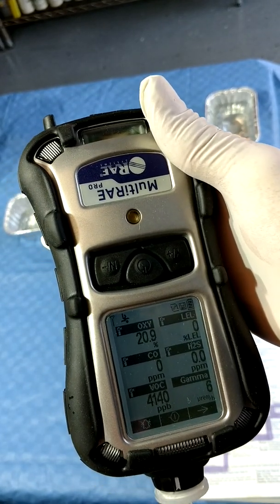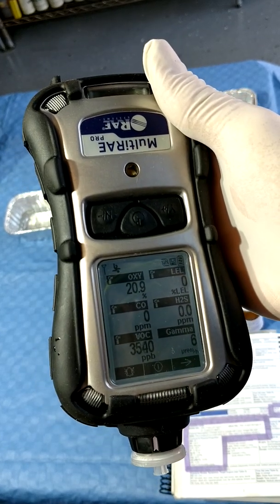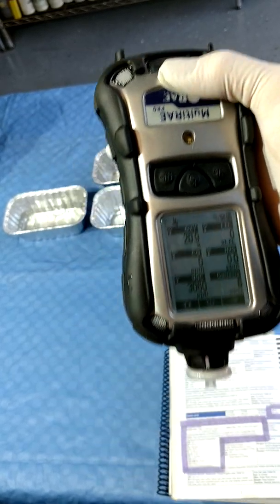We'll let the reading come down for a minute. Now we'll take a sample of the glacial acetic acid.